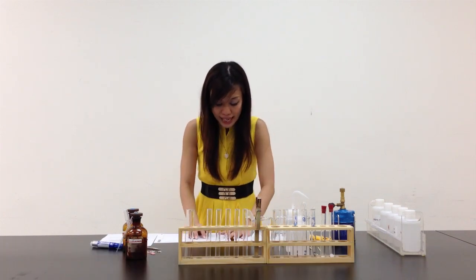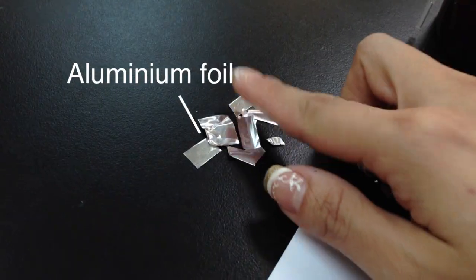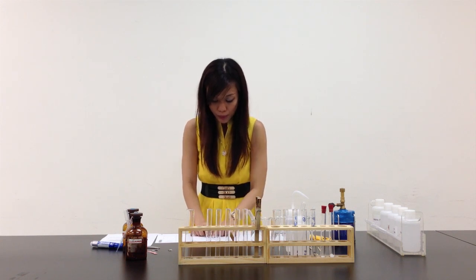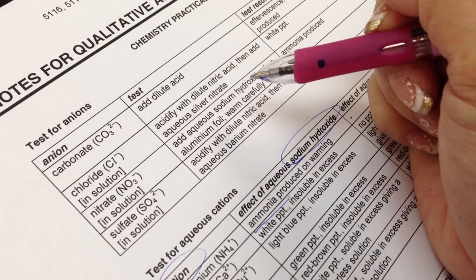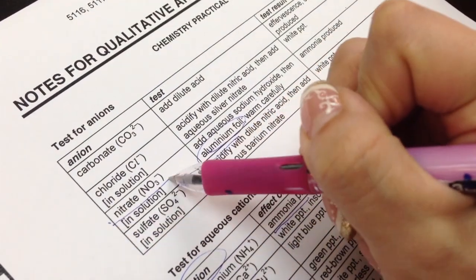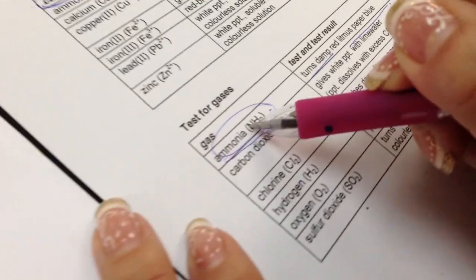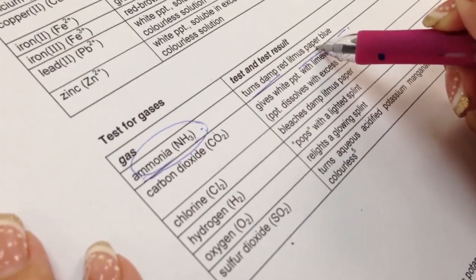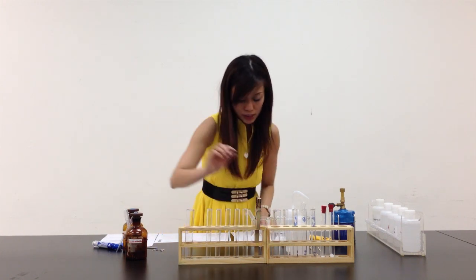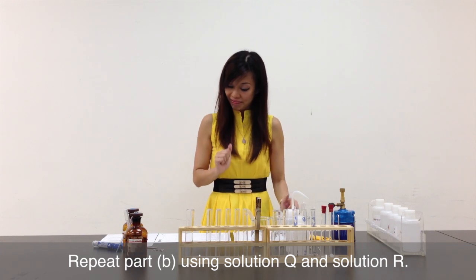It also says: add a piece of aluminium foil to the test tube and warm the mixture, then test any gases evolved with litmus paper. According to the QA notes, sodium hydroxide followed by aluminium foil is actually testing for nitrate — and ammonia gas will again be evolved. So I'll need to test for ammonia gas again; more red litmus paper will be used. Let me cut some more for the second part. And of course, I will have to repeat all steps for solution Q and solution R.